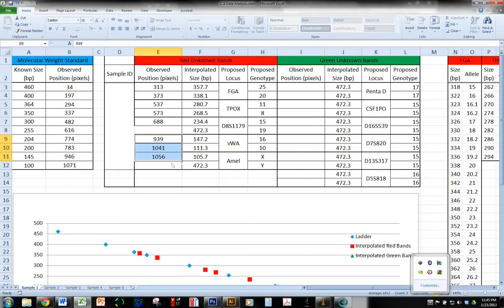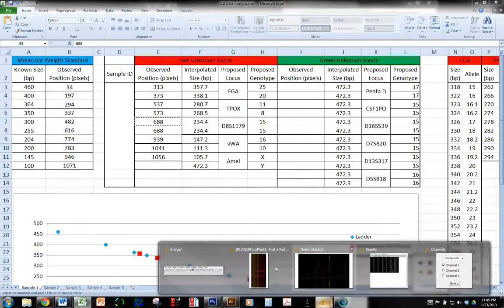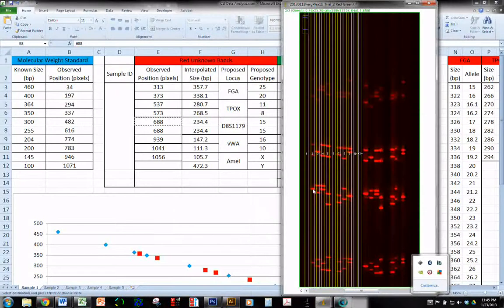I screwed up the formatting, but for the purposes here, it shouldn't matter. You can see that this is automatically defaulting the blank cell to the highest allele. You can just copy this and paste it here because these 2 bands are running right on top of each other. What that means is that there's only a single band present at this locus. It's homozygous, and so the genotype is 15, 15. The maternal allele is 15 and the paternal allele is 15.